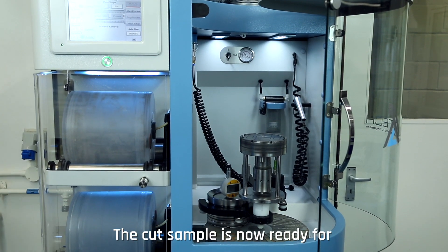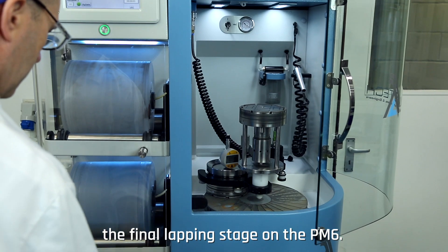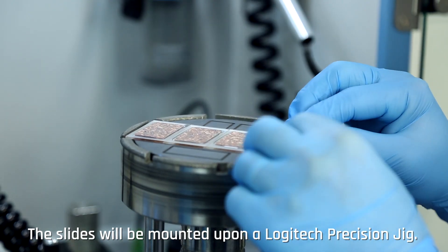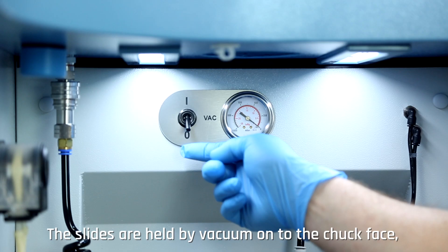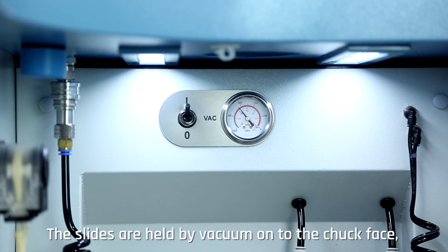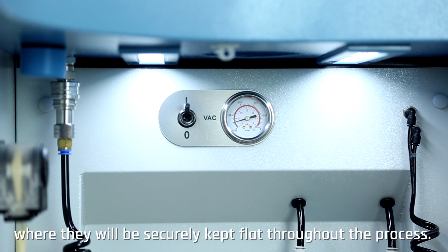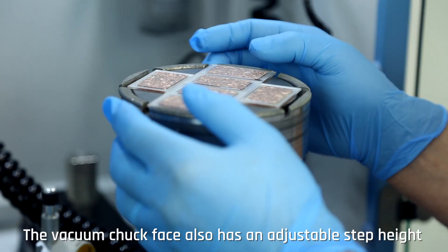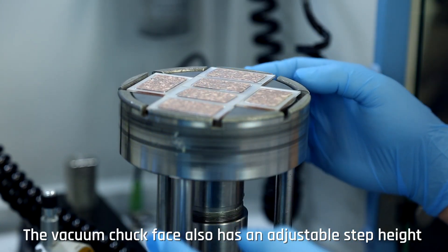The cut sample is now ready for the final lapping stage on the PM6. The slides will be mounted upon a Logitech precision jig. The slides are held by vacuum onto the chuck face, where they will be securely kept flat throughout the process. The vacuum chuck face also has an adjustable step height for high levels of accuracy.